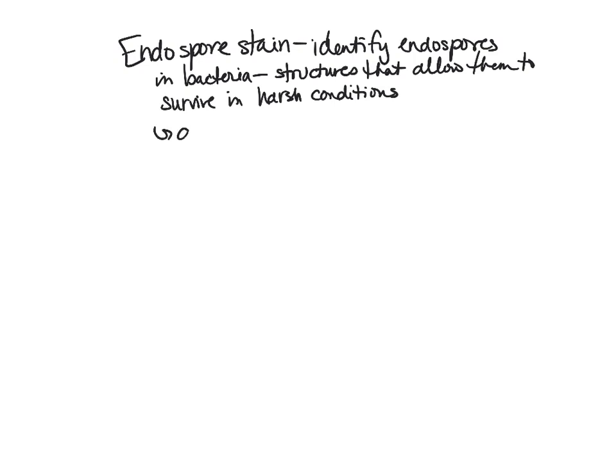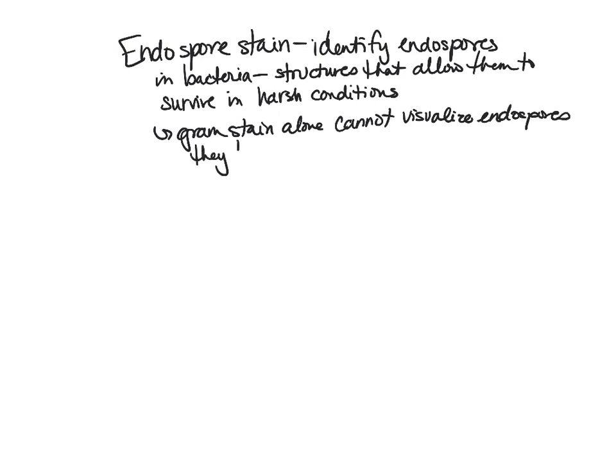So we can say that gram stain alone cannot visualize endospores. They look clear. So instead, we have to do an endospore stain.